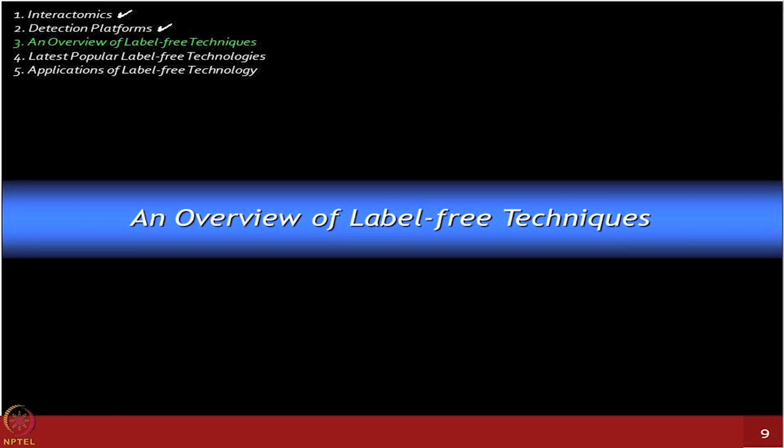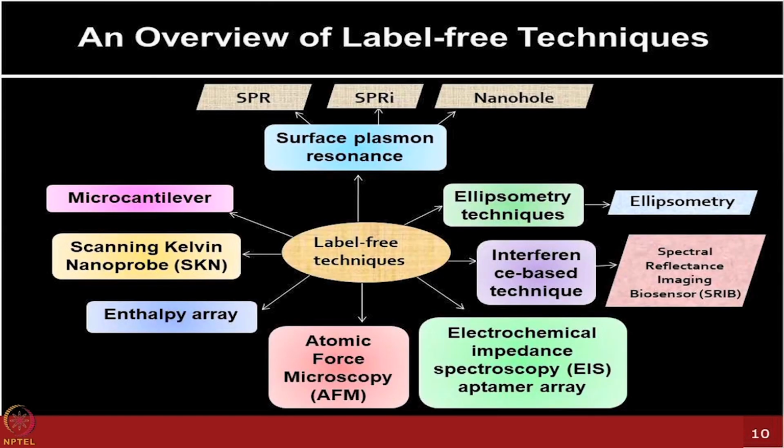Now, just to give you a feel, we are covering 2 or 3 label free technologies in this course, but there are many which are actually under development. And there are a lot of physics people who are contributing toward making many types of biosensors, where they involve different physical principles to measure molecular interactions.